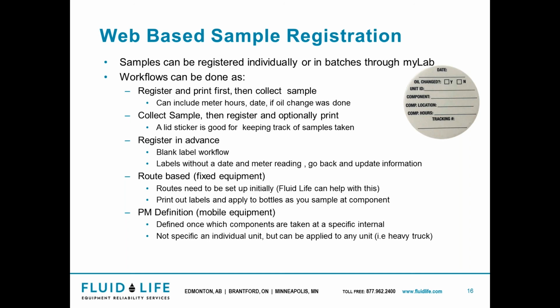So basically what you would do is take your box of bottles, go to the sample, and write on the lid what you sampled. Now, you don't necessarily need the lid sticker, but they're really good to have. It's just easier to keep things tracked for you. You can register in advance, and basically labels without a date and meter reading go on there, and then you go back later and update the information in myLab.